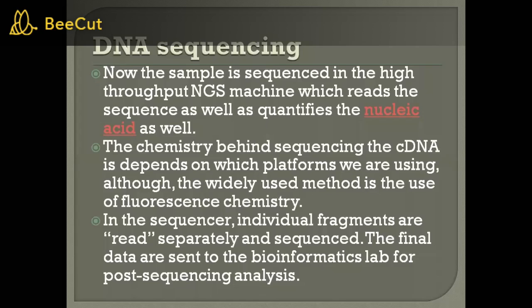So here we can use Illumina sequencing or Ion Torrent sequencing, or we can also use ABI SOLiD sequencing. Any of the methods we can use, but depending on the method, some of the protocol changes. After getting that result, we analyze that data by using certain bioinformatics tools.